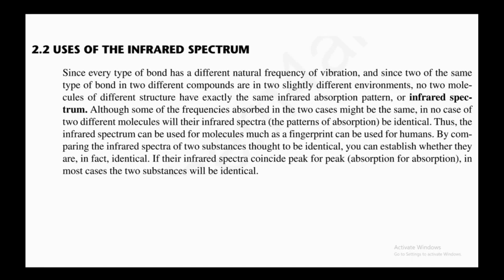Those compounds can be characterized using IR spectroscopy, which serves as a fingerprinting method for detection of different vibrational energies or states present in the covalent bond.